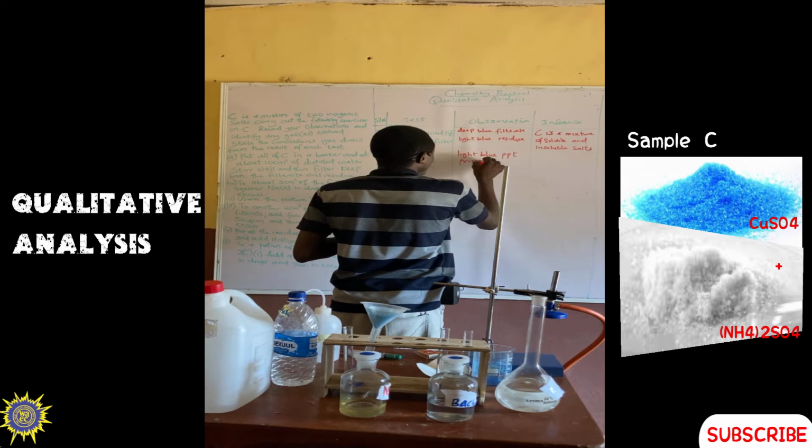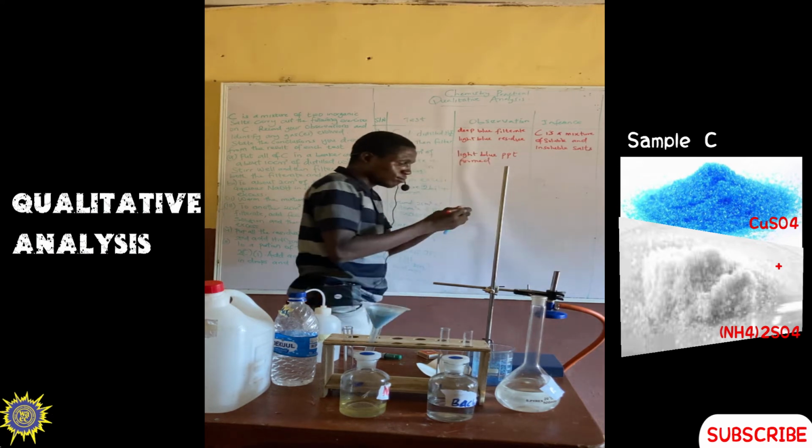In drops, we have a light blue precipitate formed. Then when you have more of it, what do you have?